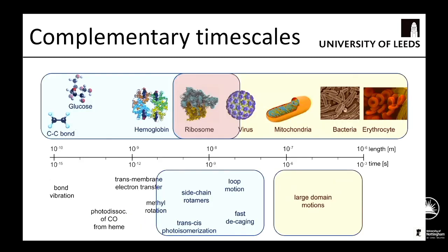So for clarity, what are the time resolutions that we're looking at? Well, we're not trying to compete with the XFEL beamline. The XFEL people are doing a brilliant job at doing femtosecond, picosecond time resolutions, looking at catalytic mechanism, looking at side chain motion. This is something that we're not delving into with time-resolved electron microscopy.